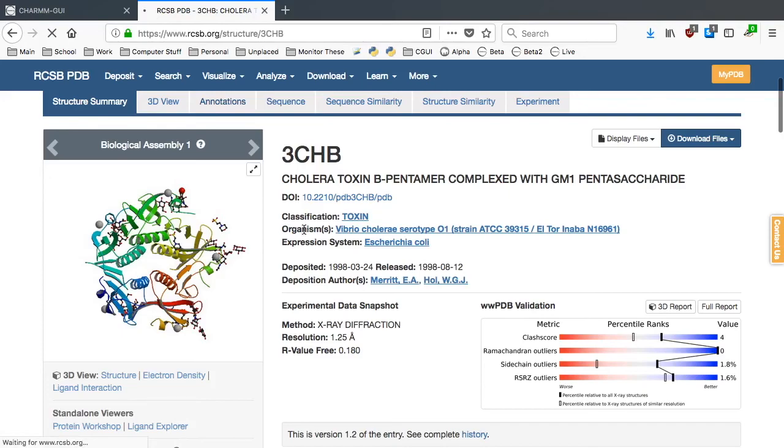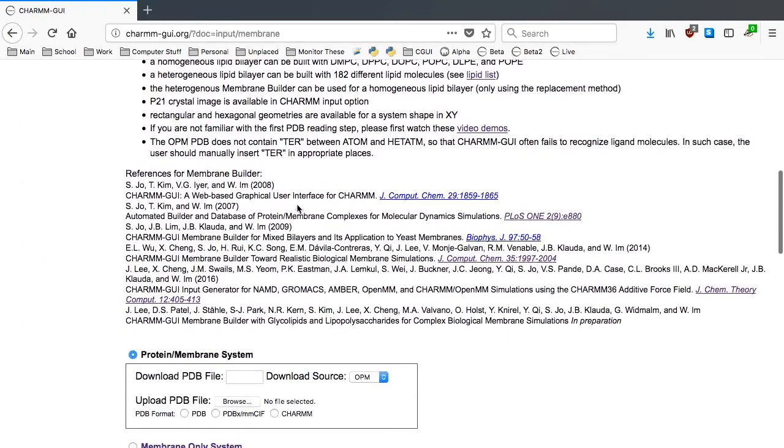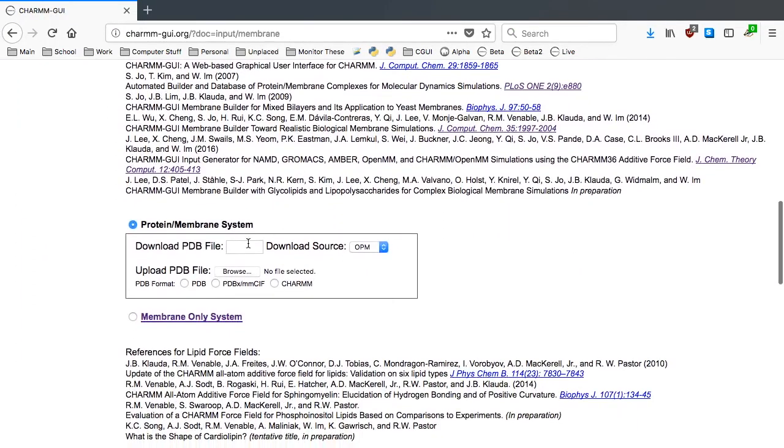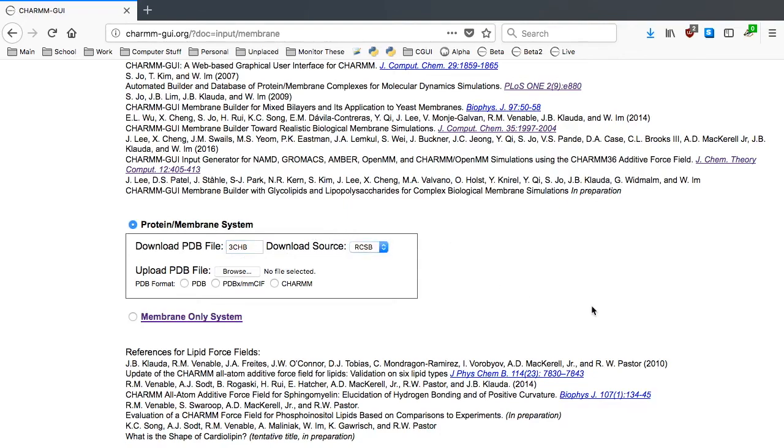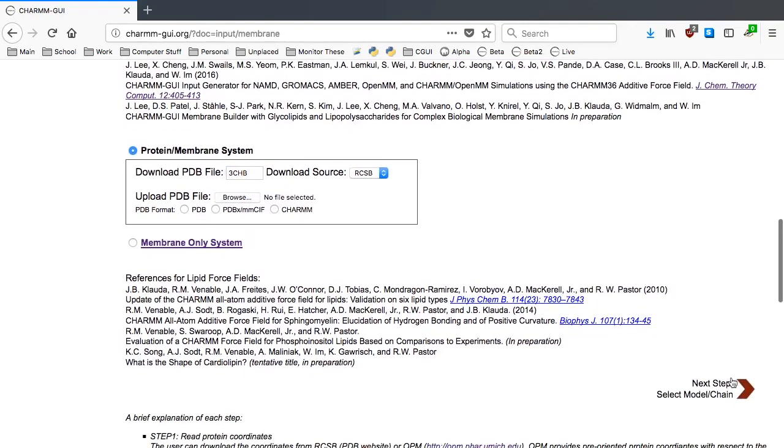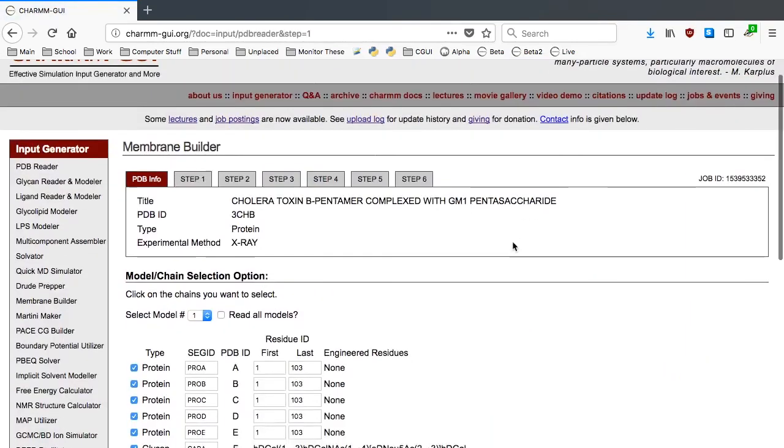Let's start by going to Membrane Builder. Type 3CHB and change the download source to RCSB because the OPM database doesn't contain this structure. Then go to the next step.